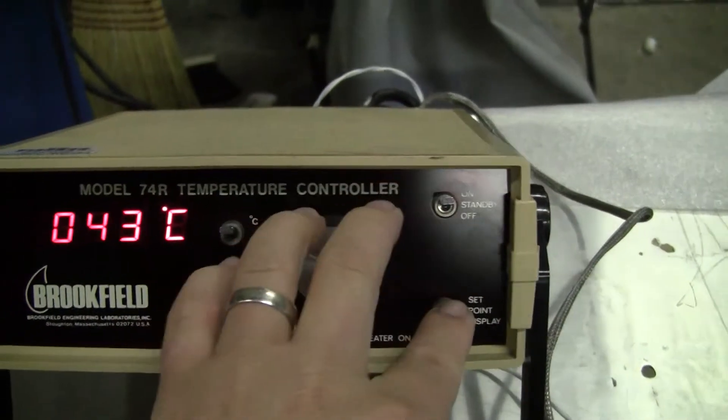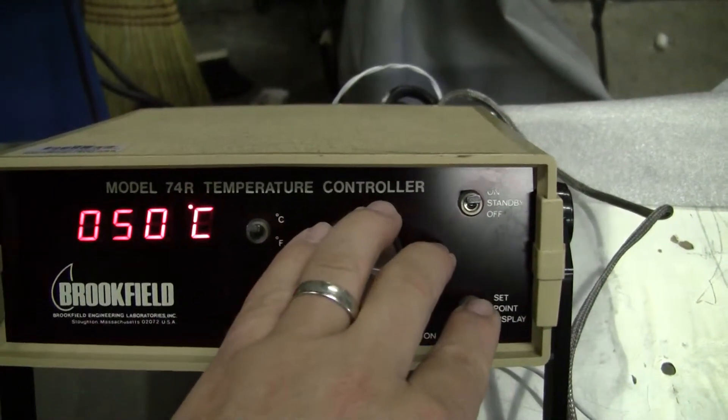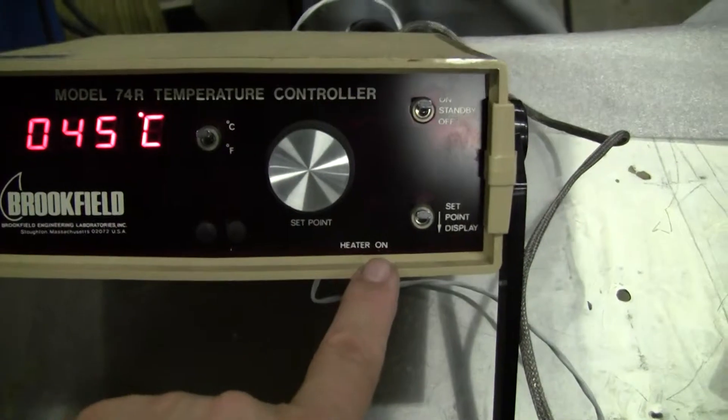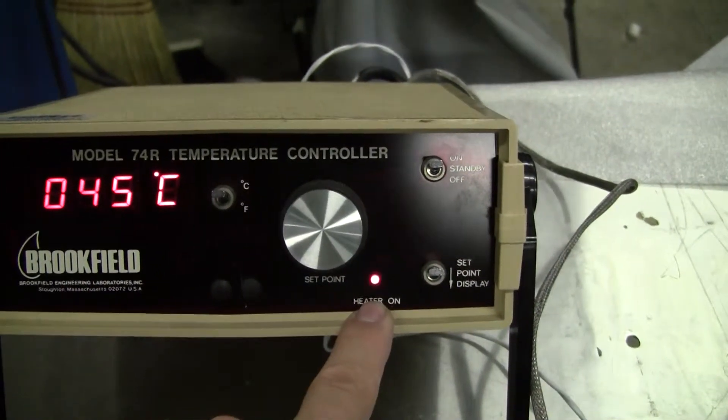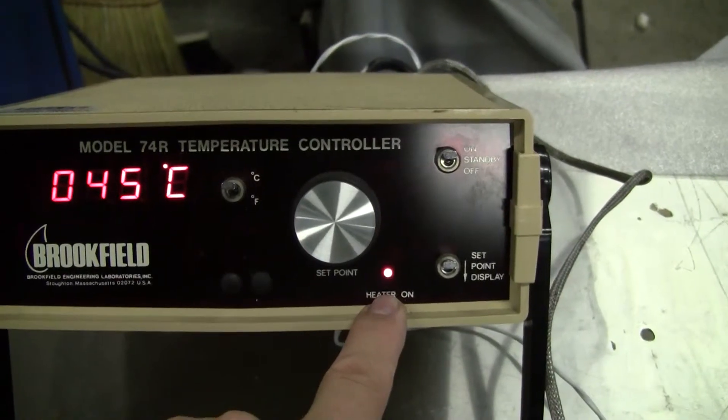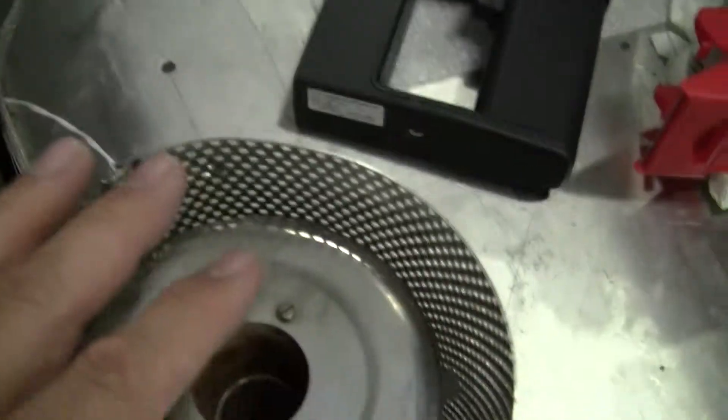But when I change the set point to a higher number, say 50, you'll see the red light after it goes through its process. You will see a red light come on indicating that it's throwing heat to the cylinder, or to the heater, excuse me.